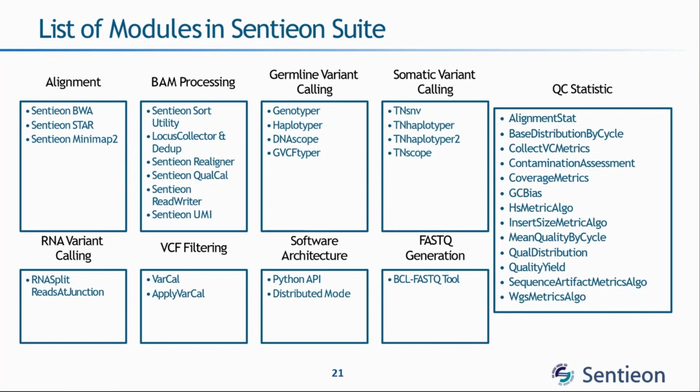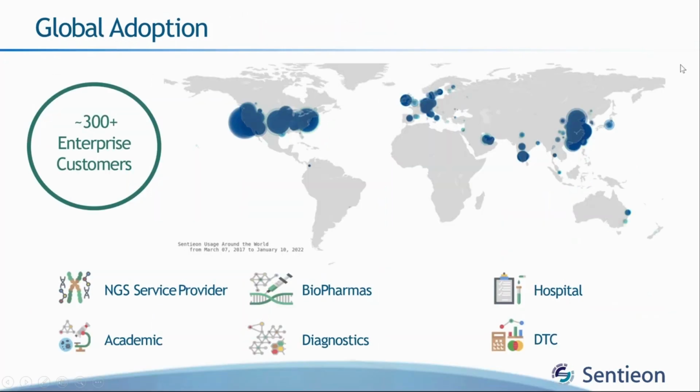So you can say that Sentieon uses existing GATK best practices guidelines and provides an improvement on the alignment software such as BWA-MEM, STAR, and Minimap2, and variant calling tools such as GATK Haplotyper, Mutect, and Mutect2. Now, who should be using Sentieon? So Sentieon is a software that is appropriate for researchers that are working with data from genome sequencing, molecular diagnostics, pharmaceutical, biotech companies, consumer genomics, and cancer research facilities.